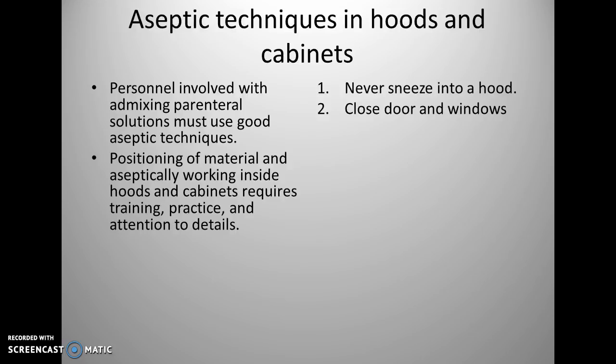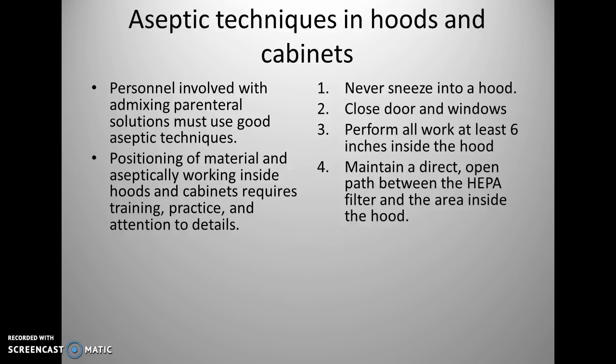Close doors and windows. Contaminants can't go in, so you want to make sure that there's no flow of air coming from outside to inside. Perform all work at least 6 inches within the hood. That prevents contamination from getting from the edge of the hood into your work.